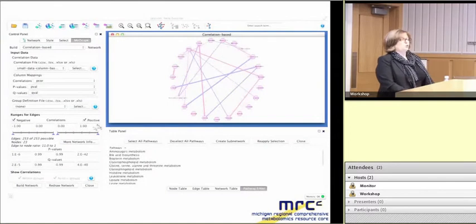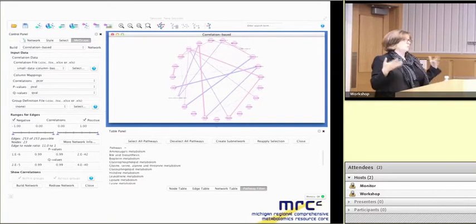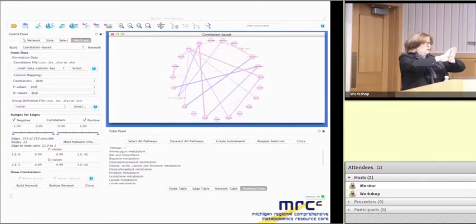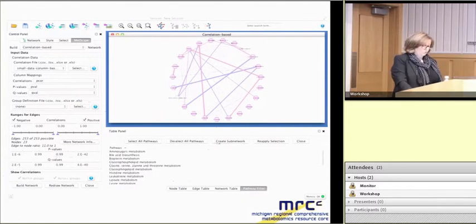You have various options to put information about groups in your data, for example, if you have a lipidomics study and you know what lipid classes you have in your data, you can also put that information. And you may want to look at correlations between different classes of lipids, because what we know is if we have measured a group of free fatty acids, chances are that they will be strongly correlated, and you will not see other correlations that you might be looking for in your data. So we want to be able to say, okay, give me between group correlations only, and all of that is embodied here, okay?